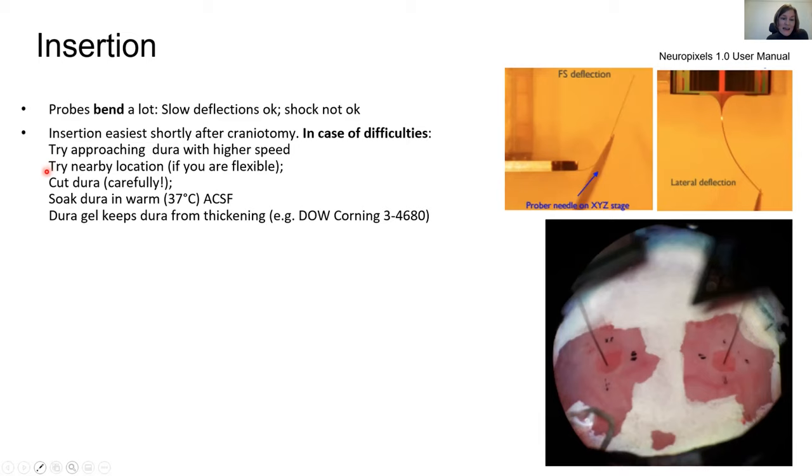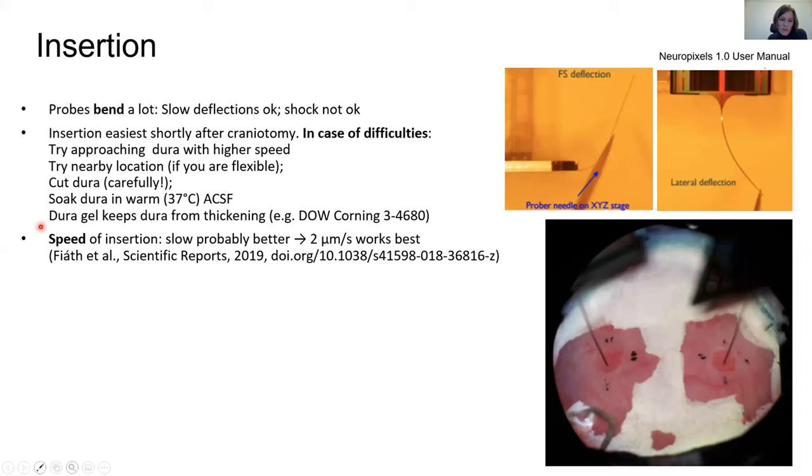The insertions will be easiest shortly after the craniotomy, because the dura is usually nice and soft. If you have difficulties inserting the probe, you can try and approach the dura with a higher speed. You can try another location if you're flexible. You could try and cut the dura very carefully. You could also try and soak the dura in warm ACSF. Or another way of keeping the dura from thickening is using dura gel.